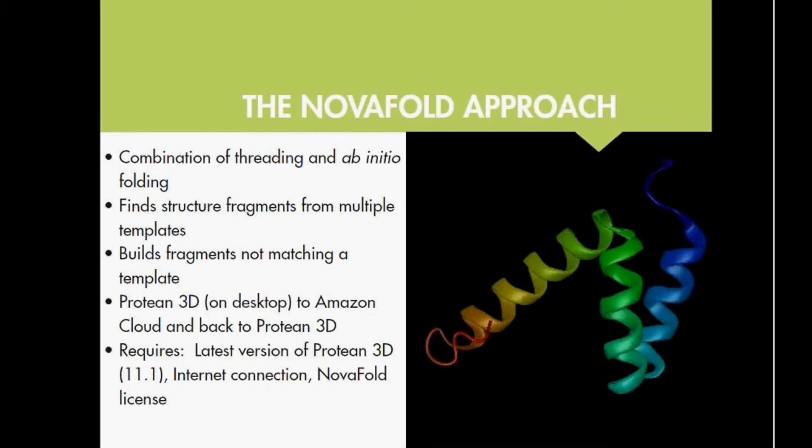In the future, we will continue to improve this code with the collaboration of Dr. Zhang. Over time, DNASTAR hopes to improve the accuracy of the program even further, as well as diverge to provide you with additional structure prediction analysis options.